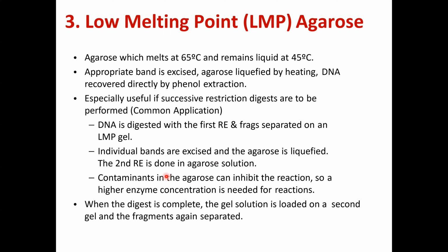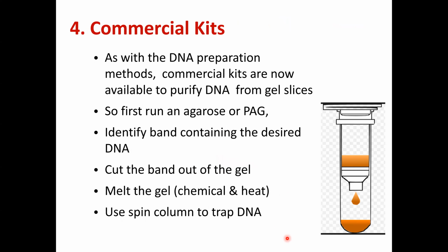The second enzyme digestion is done in the agarose solution. There will be some contaminants in the agarose that can inhibit the enzyme's action, so a higher enzyme concentration is needed for these reactions. When the digestion is complete, the gel solution is loaded onto a second gel and the fragments are separated again.